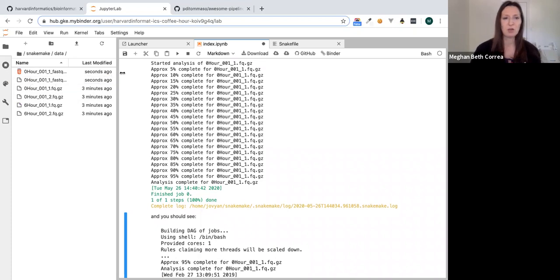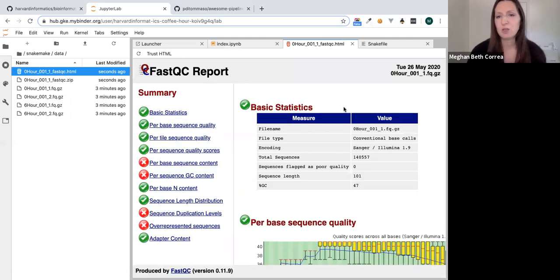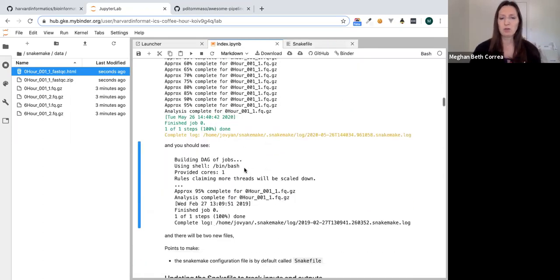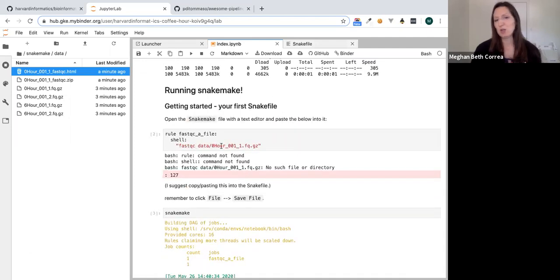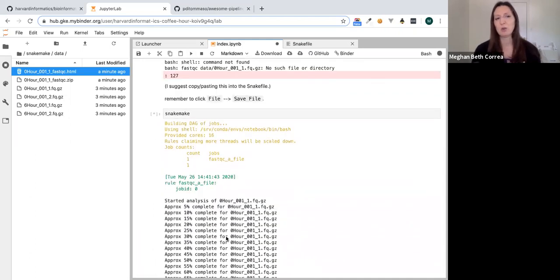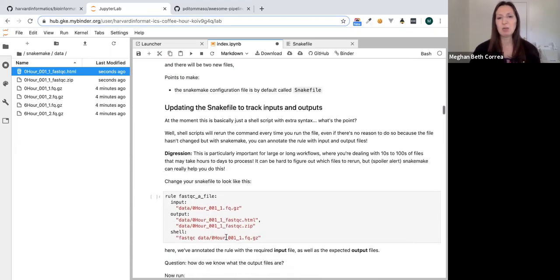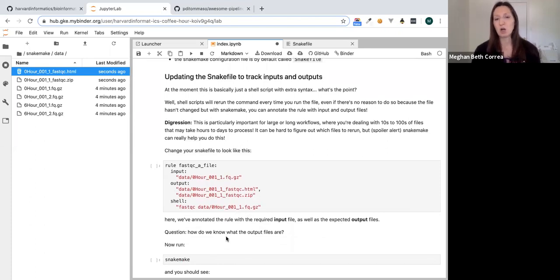We can go into the data folder and see new files: a zero-hour .html and .zip file — an example of a FastQC quality report. That worked, but it's not very impressive because all we did was run a bash command. If we run Snakemake again, it just reruns. It's not doing the re-entrancy I mentioned at the beginning, because we haven't yet told Snakemake what the dependencies are for this rule.